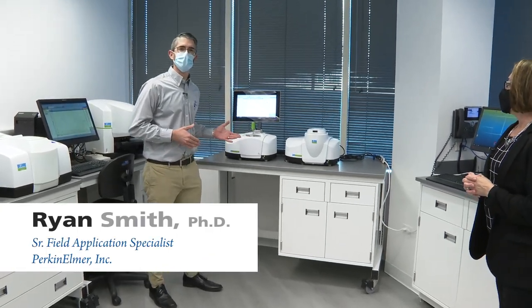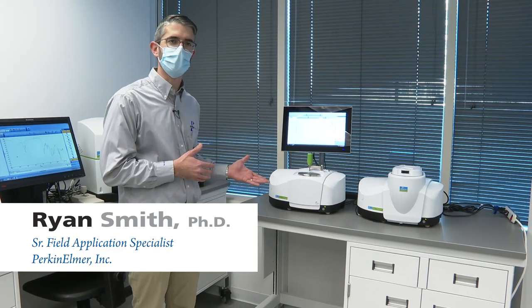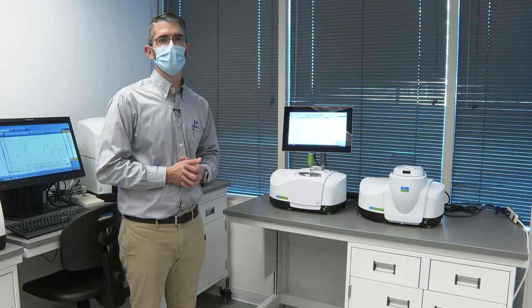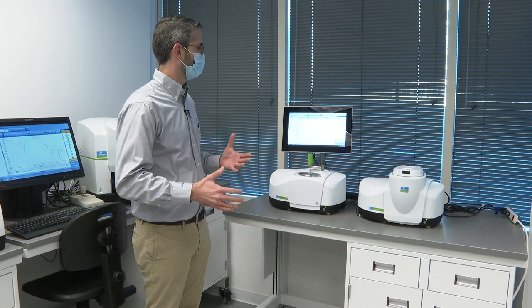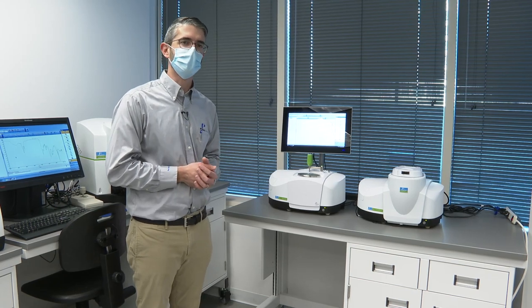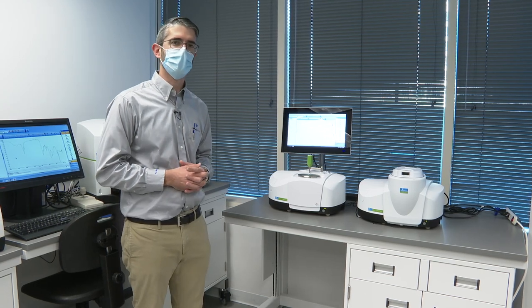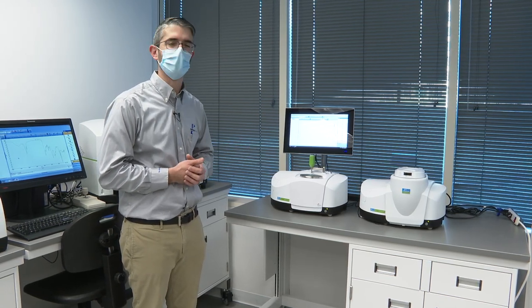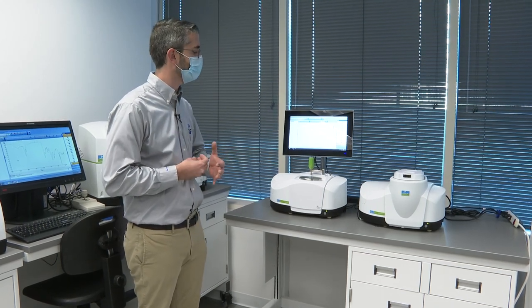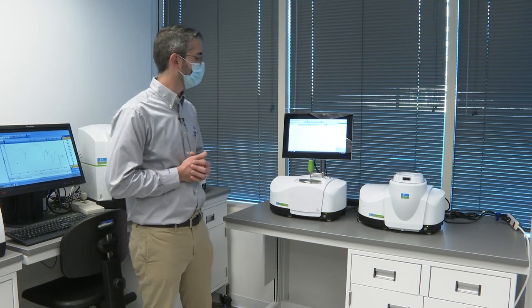Sure. So here we have the Spectrum 2 and Spectrum 2N FTIR instruments. As you can see these instruments have a very small footprint but they incorporate several technologies which make them both high quality, performing high quality measurements as well as very low maintenance. The Spectrum 2 and 2N benefit from what we call the OpticGuard technology which protects the critical internal optical components with desiccant packs that we warranty for three years from the factory and which tend to last much longer in the field.